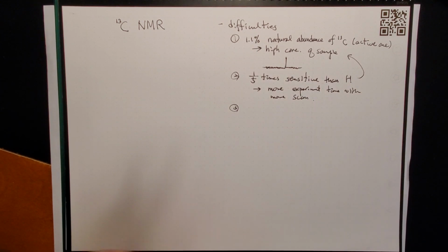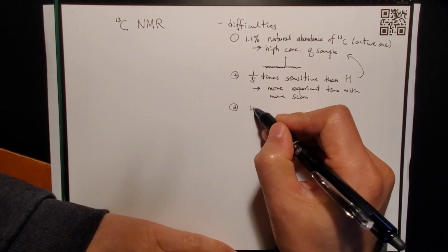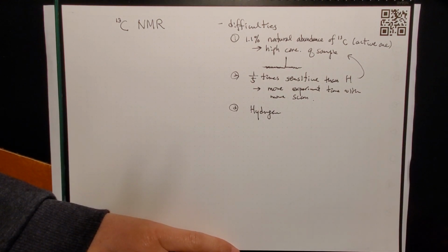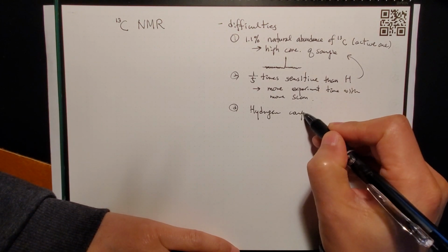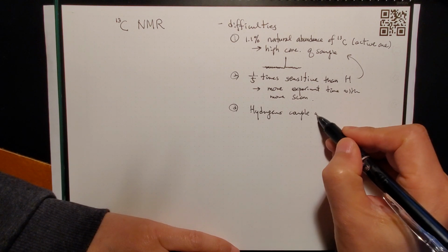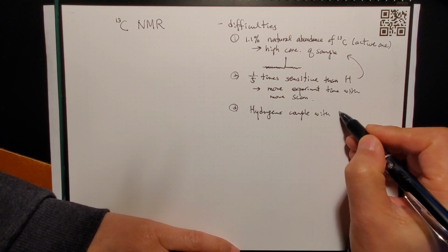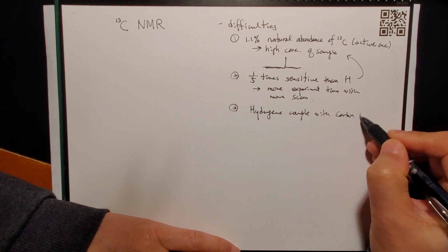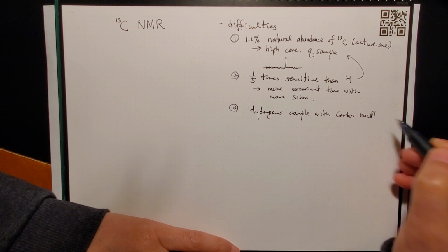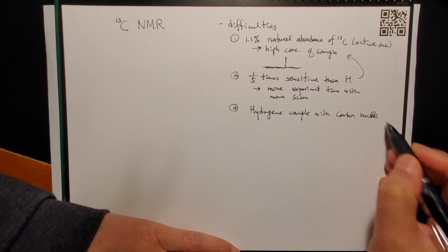Also, the hydrogens on each carbon actually couple with the carbon nuclei.